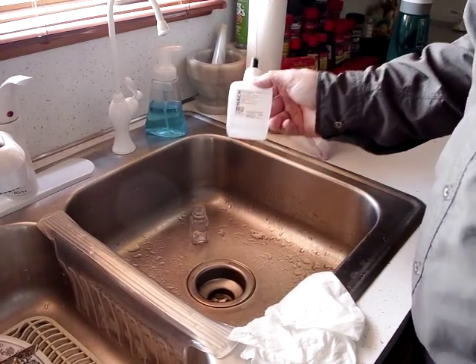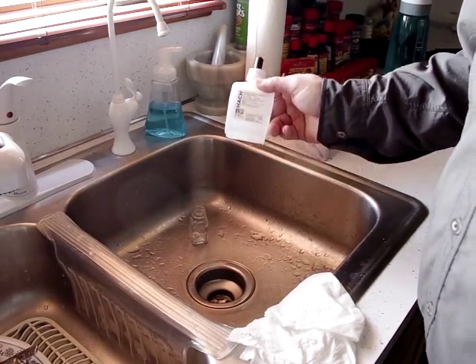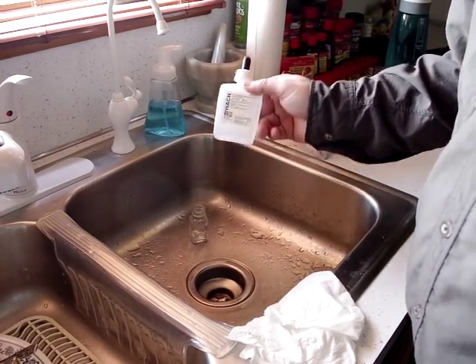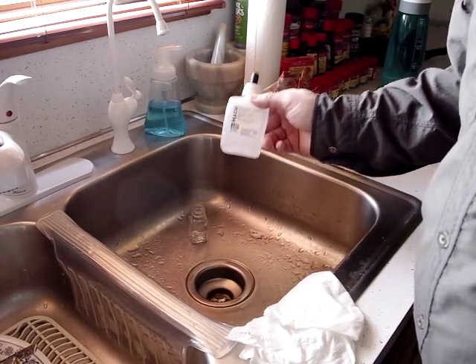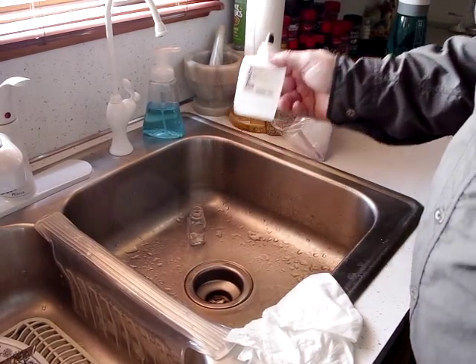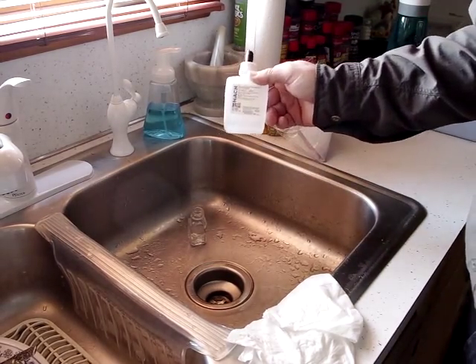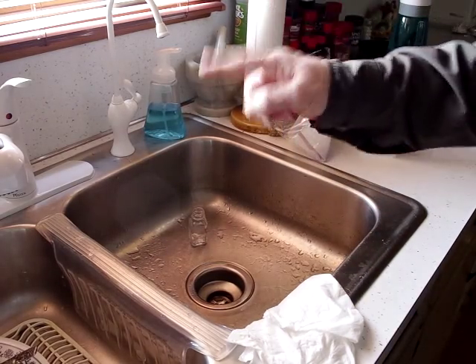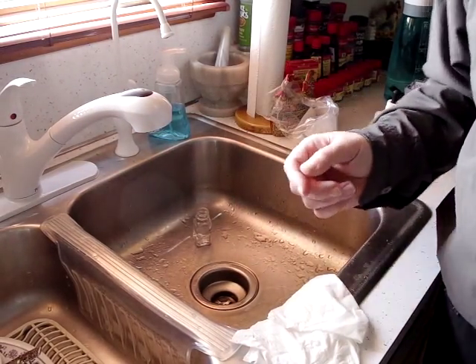TDS meters — they're a waste. The TDS meter doesn't know the difference between a salt ion and a calcium ion, or a magnesium ion, or an iron ion, or aluminum. As long as it's electrically conductive, a TDS meter doesn't care. You're going to get the same reading of salt as you will with a hardness mineral. You need to do a titration if you really want to know how well your water softener is working to keep scale and buildup off of your fixtures. Thanks.